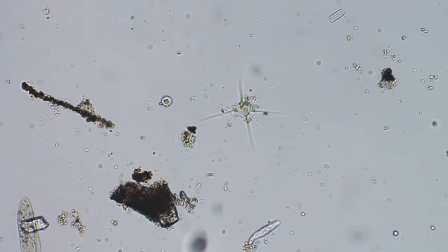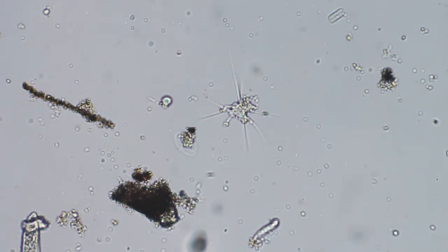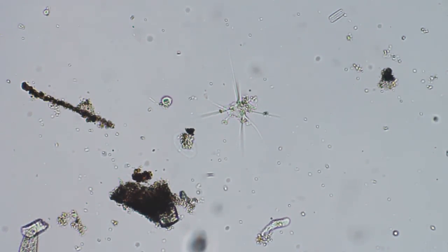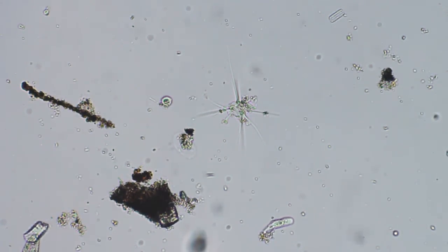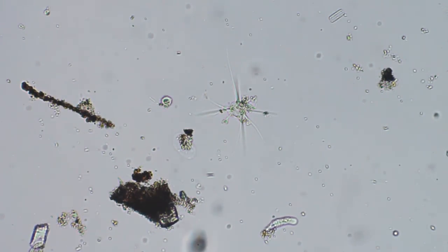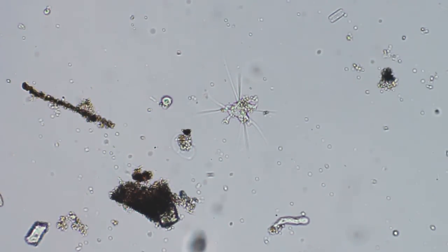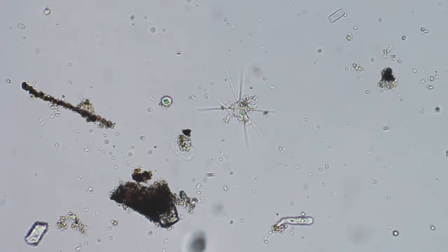He's quite changed the shape quite a bit. There's another different type of amoeba there at the bottom.